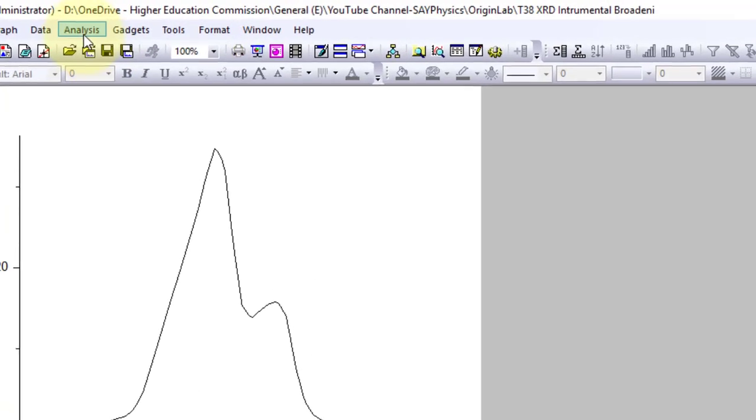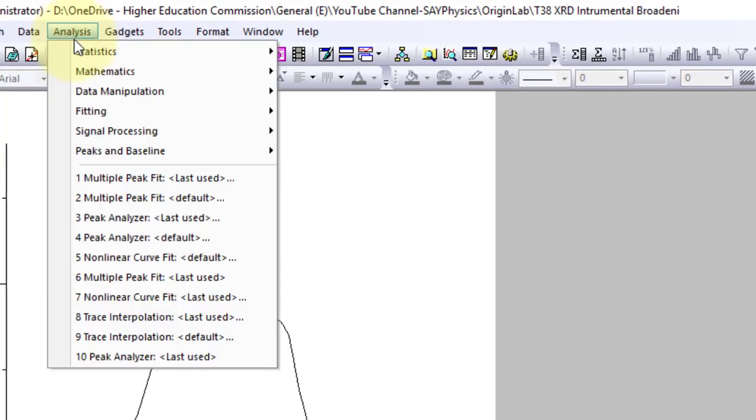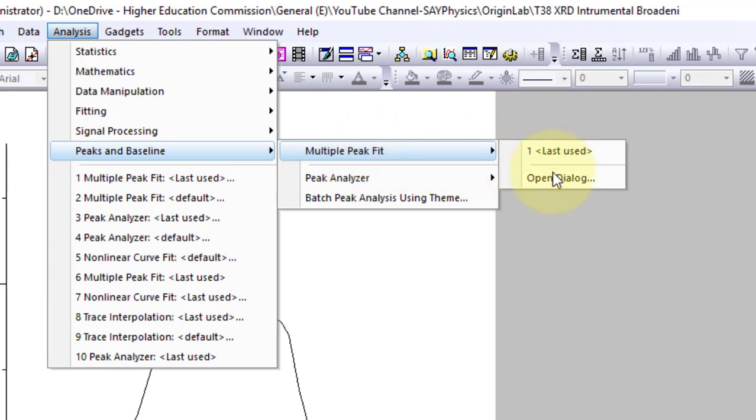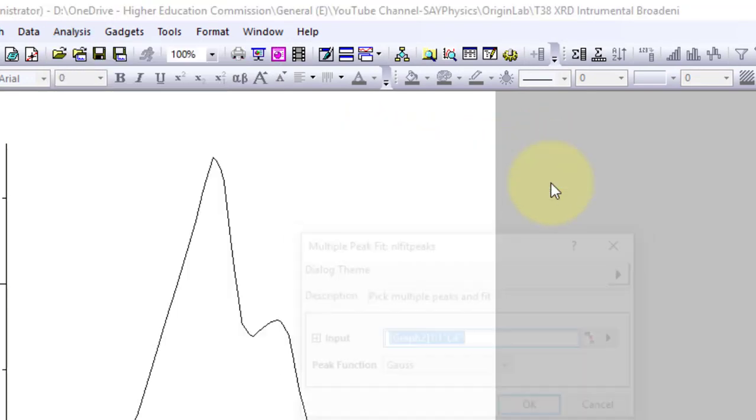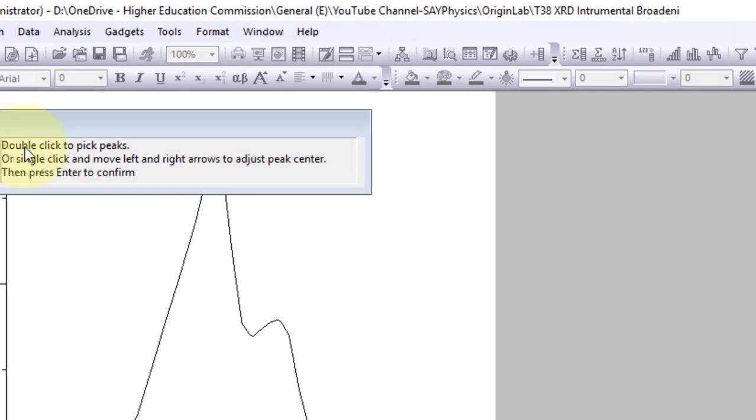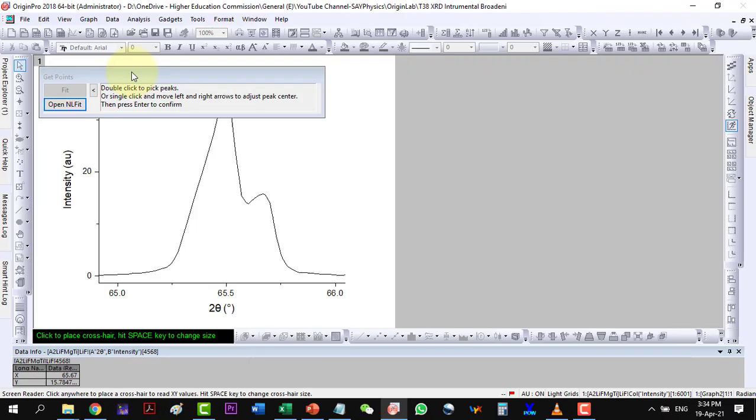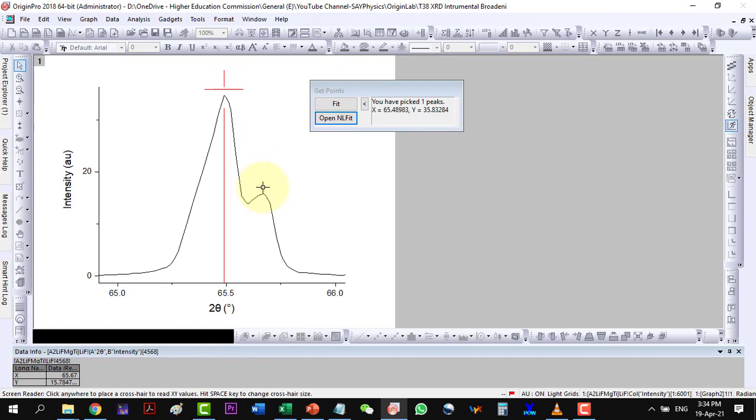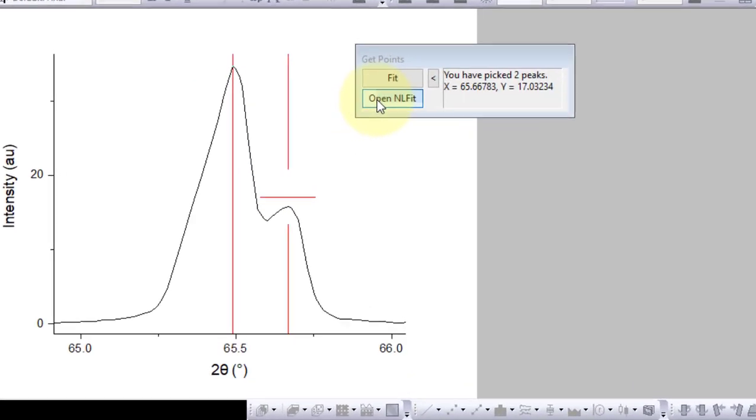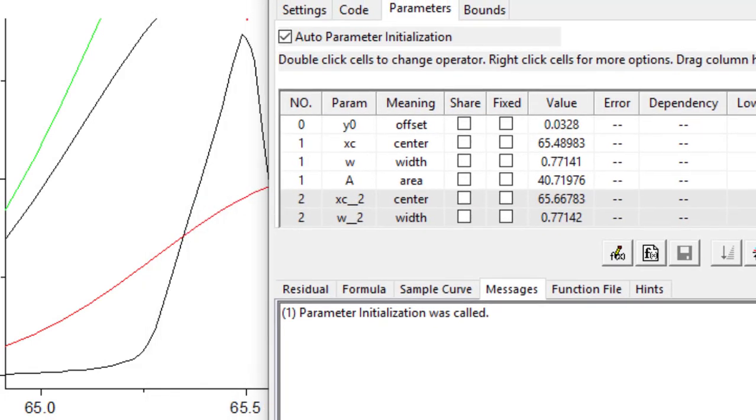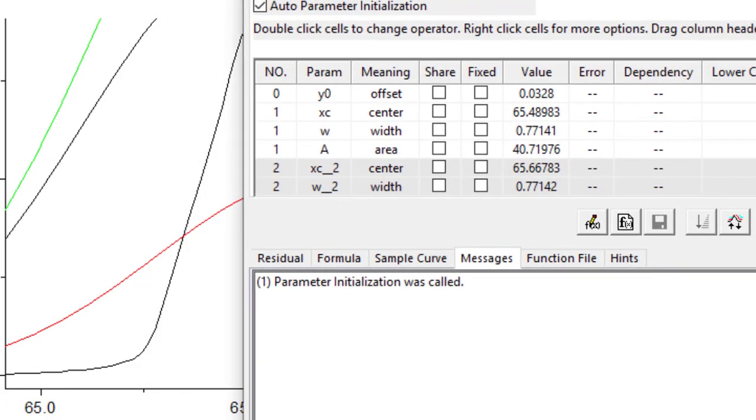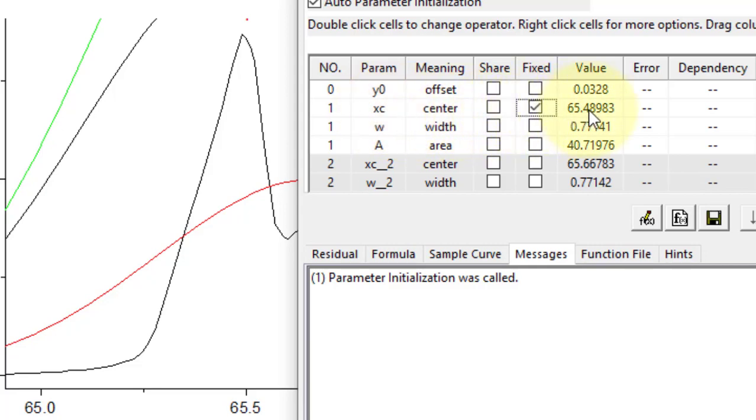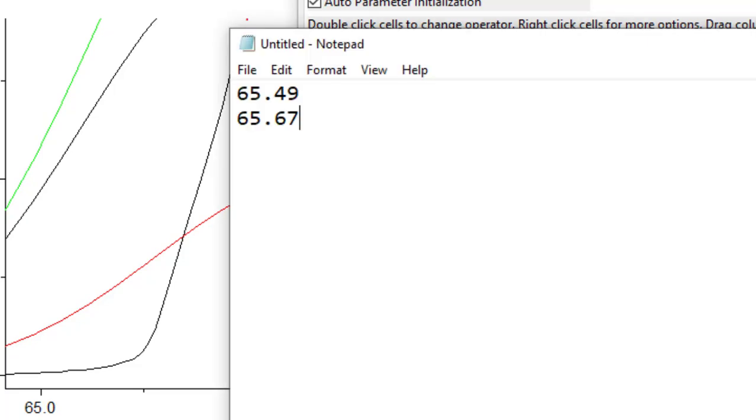Now go to Analysis, Peaks and Baseline, Multiple Peak Fit and open dialog. Go on with the Gaussian fitting, double click to pick the two peaks, open nonlinear fit. As both the peaks are so close to each other, their deconvolution is a bit tricky. Here we will have to put some restrictions on the peak positions as the peaks are very close and it might not fit them well. So fix the peak 1 and peak 2 positions.